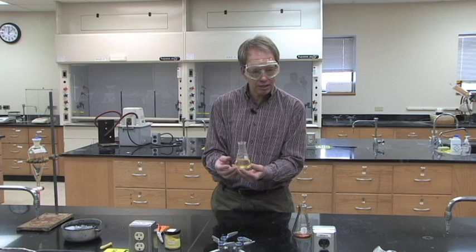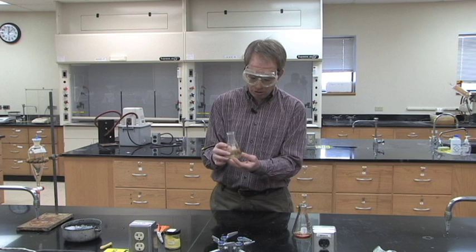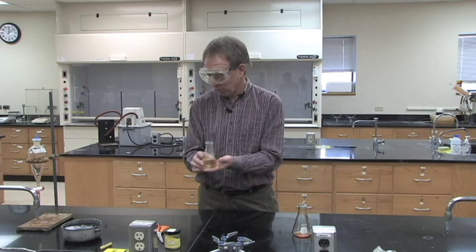You can do a melting point on those crystals. For the other flask — the sodium hydroxide layer — add hydrochloric acid to it. Since you know how much sodium hydroxide you added, you know how much hydrochloric acid you'll need to add to neutralize it. Add it in and you'll get a precipitate to form.